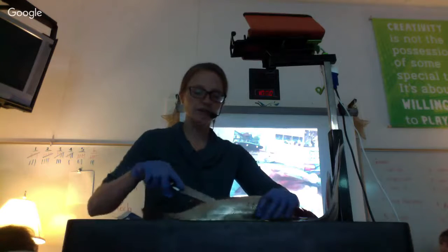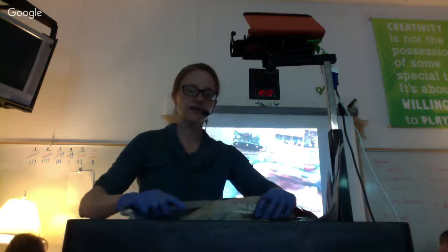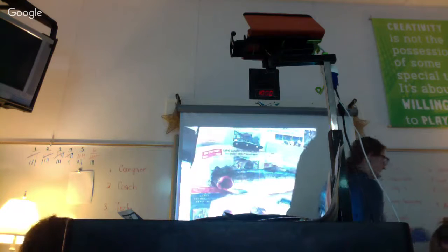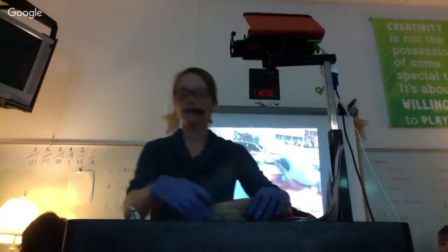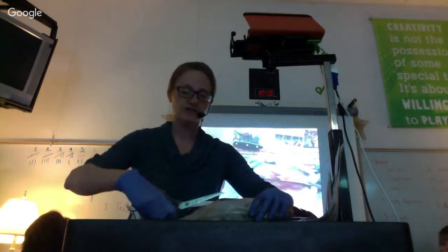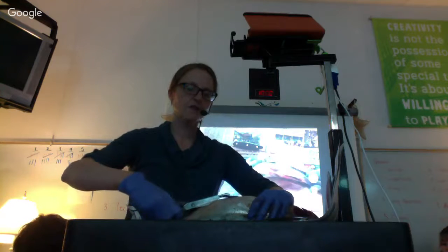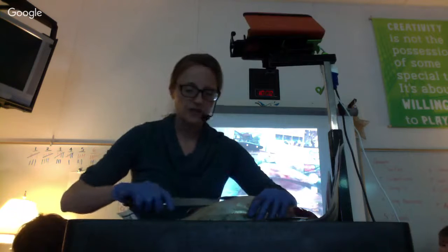Okay? And I'm just going to show you, you're going to have to be very gentle because, of course, we have the internal organs. Now, another thing you can do too, which might help, I just use scissors. If you're choosing to talk, you're telling me you just need a break, okay? And that's fine. It's just, what happens is it delays what we want to get through, okay? So it's easier with a pair of scissors, but you can use a knife, okay? But you're going to be very gentle.